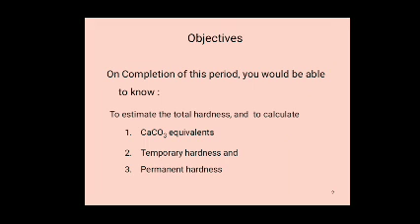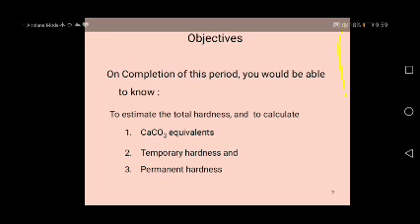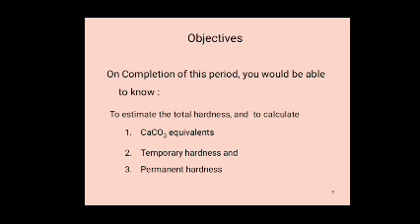These salts present in water cause permanent hardness.